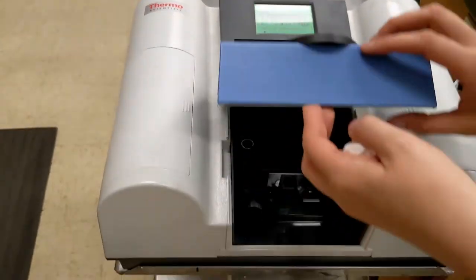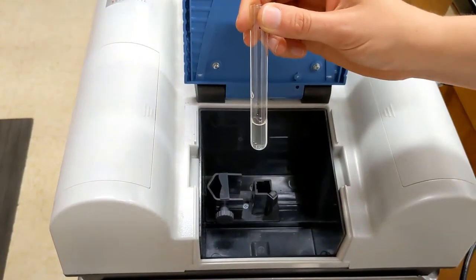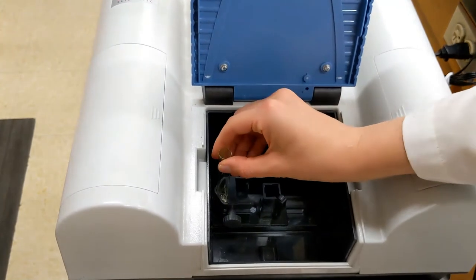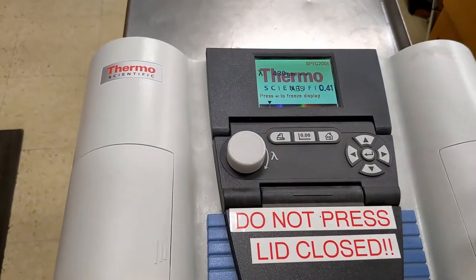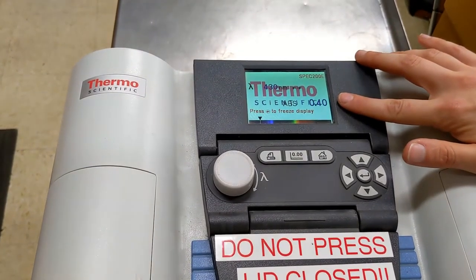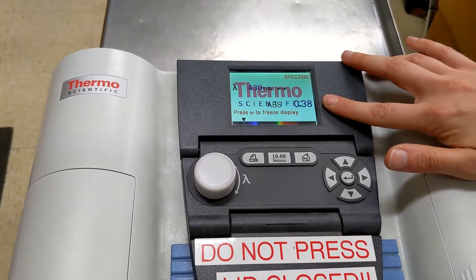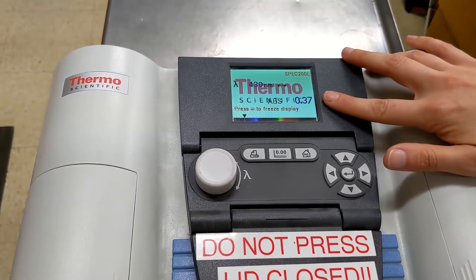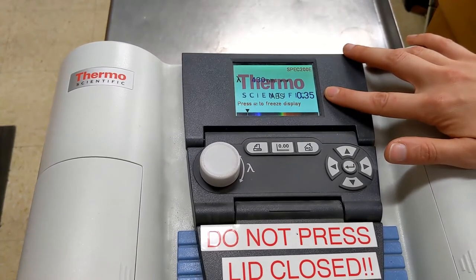We can now take the blank out and put in our experimental tube. I don't have to press anything — it will read right as it goes in. You can either wait for the reading to stabilize, which is ideal, or you can take the average of several numbers.